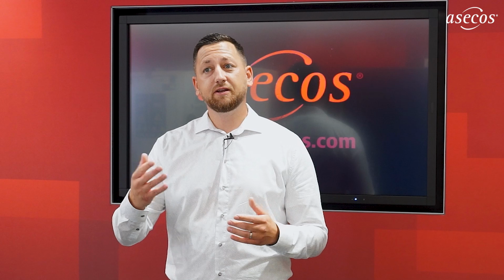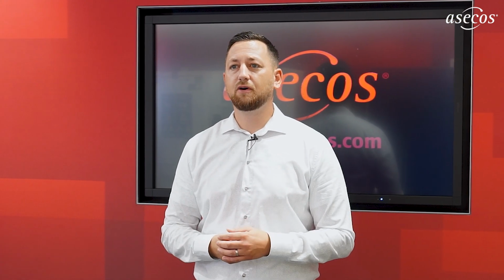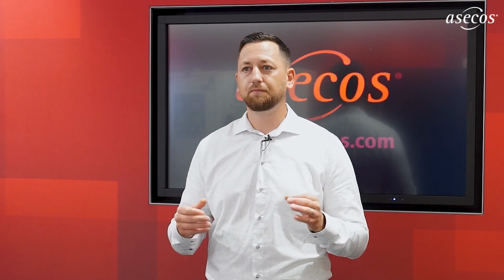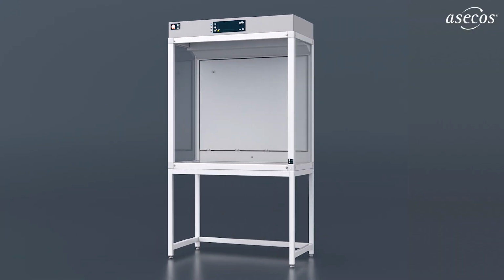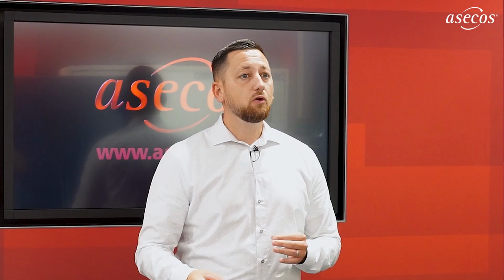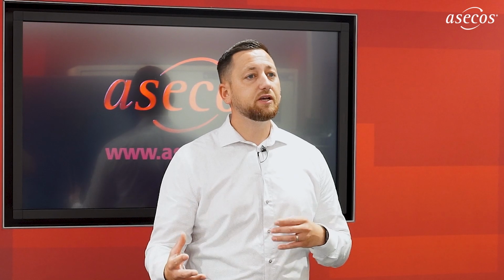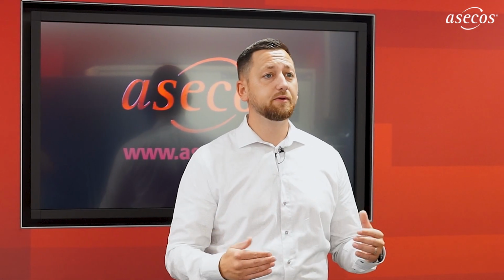I would now like to introduce you to another way of protecting people and the environment when handling hazardous substances. The GAP Hazardous Substance Workstation from asecos. Our GAPs guarantee maximum safety and health protection for the user and prevent the formation of hazardous, explosive atmospheres, even without the use of a sash.